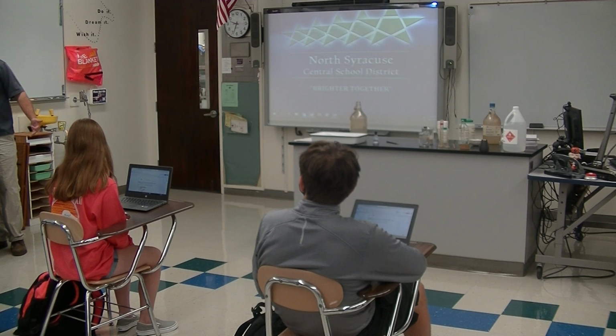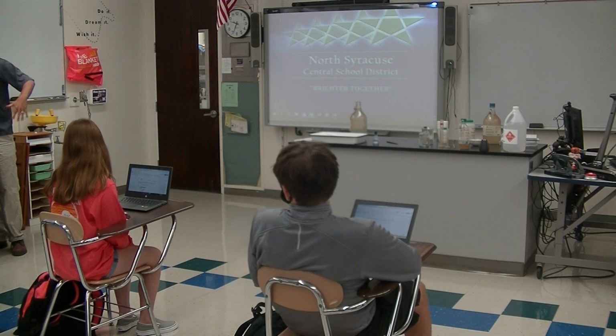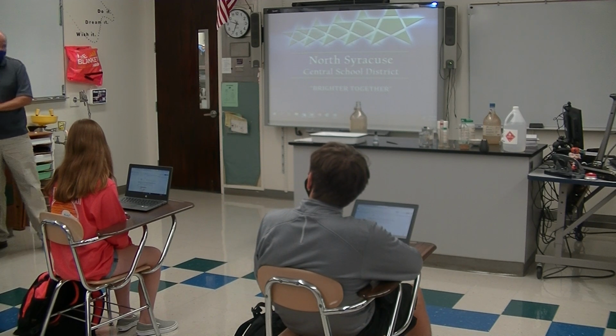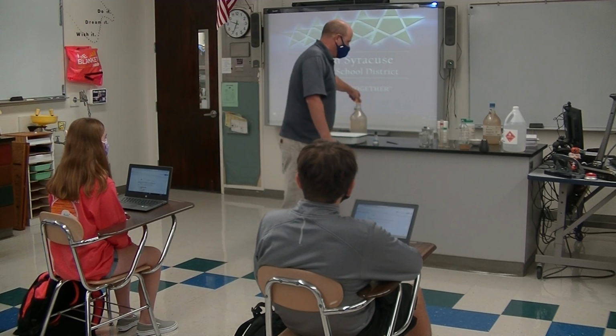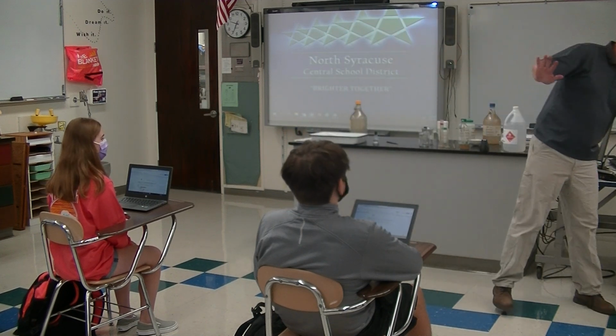Do you have time if you get something on you? Yes. You don't have to freak out, oh my god, I got acid on me, what do I do, and start wiping and running all over the place and fall and do other things. I had plenty of time to get to it. That's the second strongest acid we have in the building at the concentration that you'll never deal with. Did it do anything to my hands? I'll dry it and show you.